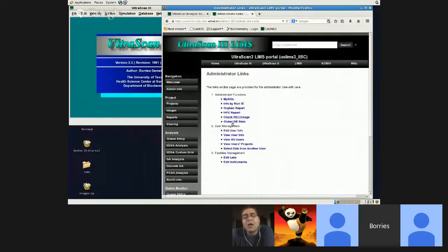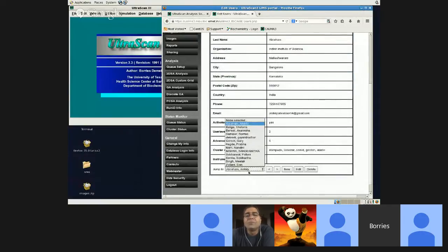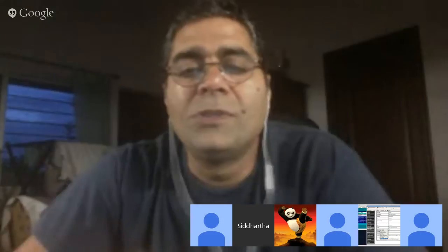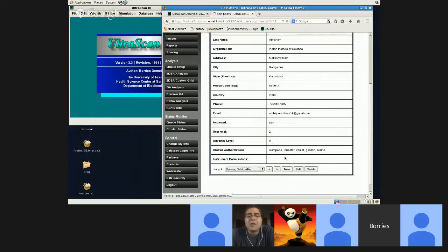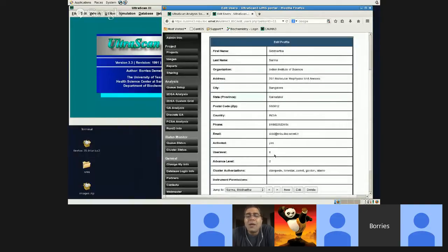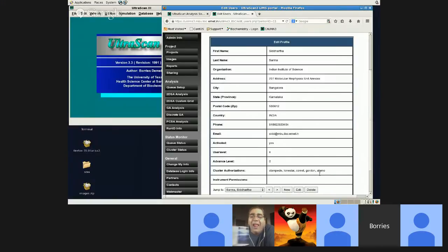So, again, what you would do is you would go here to edit user info, and then I'm going to check where is Siddhartha? The third from the bottom. Third from the, okay, yeah, there we go, thanks. So you have user level 4, okay? Okay. Which is basically super user. You're in control of the whole game over there, just like I am. Wow. So, you're the manager. So anybody have a problem, please contact Siddhartha.